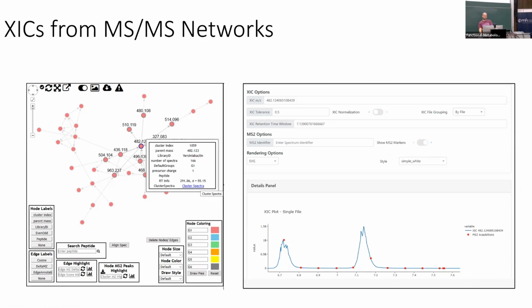And if we would inspect the MSMS by clicking on those, we would see that they actually have the same MSMS spectrum. Hence, in classical molecular networking, as this is only doing clustering based on MSMS and no feature deconvolution, that has been simply collapsed into that one node, right? So now all these MSMS spectra are combined in this one node, and by default, you would think, okay, there's one molecule with 482, but no, there have actually been diastereomers, which we could nicely separate by retention time.